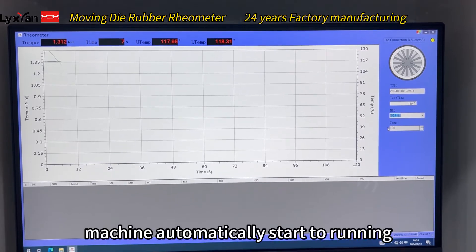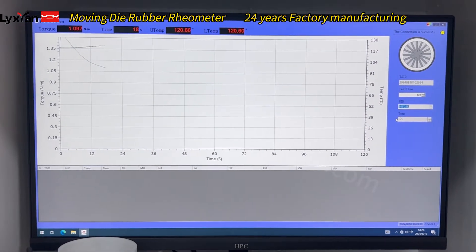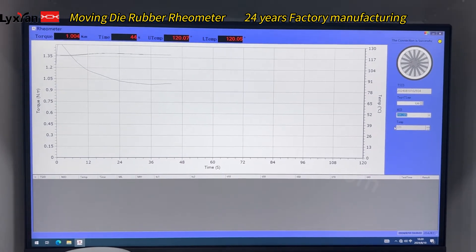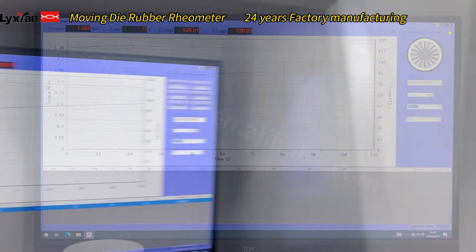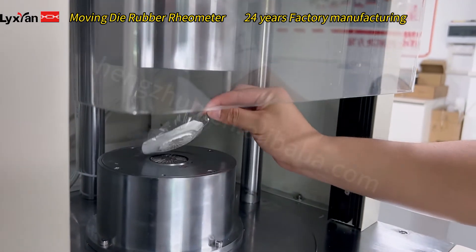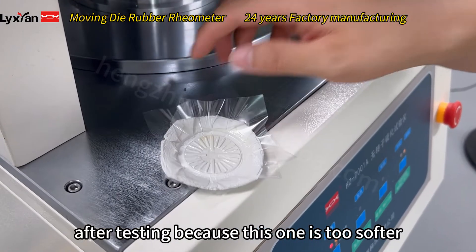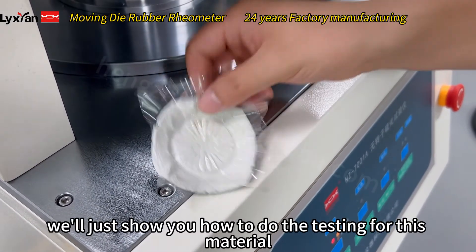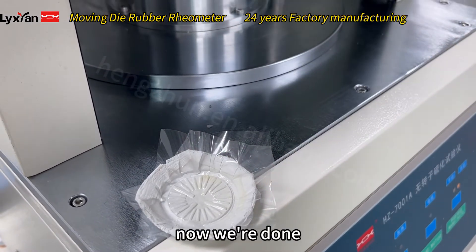The machine automatically gets started and running. So you can see, this is after testing. This one is too soft and not suitable for roast meat — we'll just show you how to do the testing for this material. Okay, now we're done.